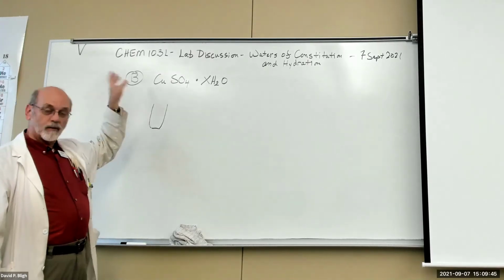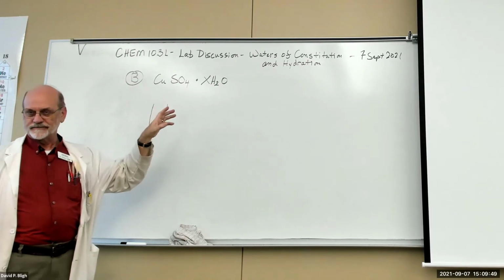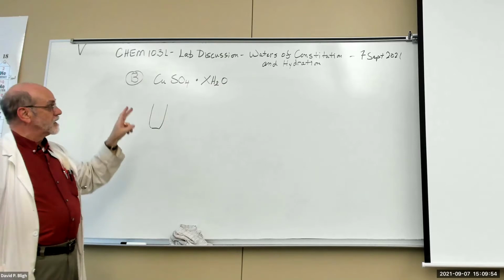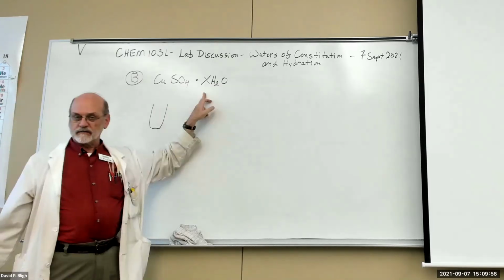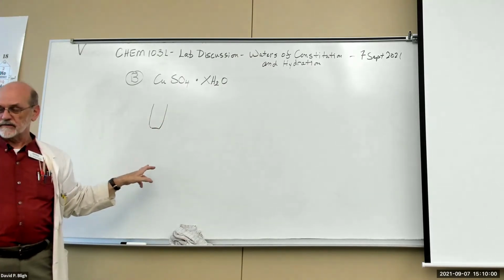We're going to perform next Tuesday, waters of constitution and hydration. It comes in two parts. Waters of hydration is the first part of the experiment. The second part of the experiment is waters of constitution.